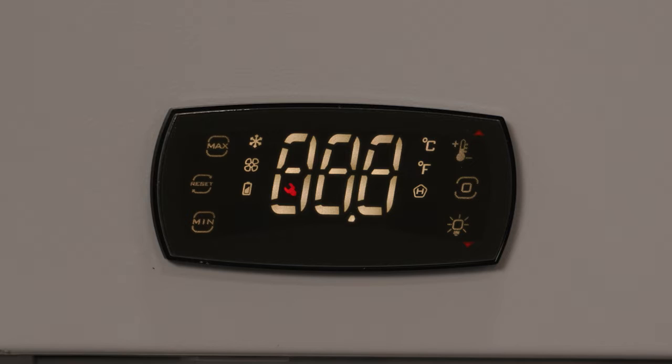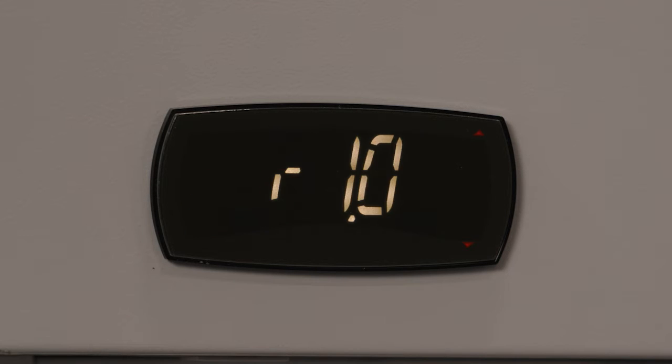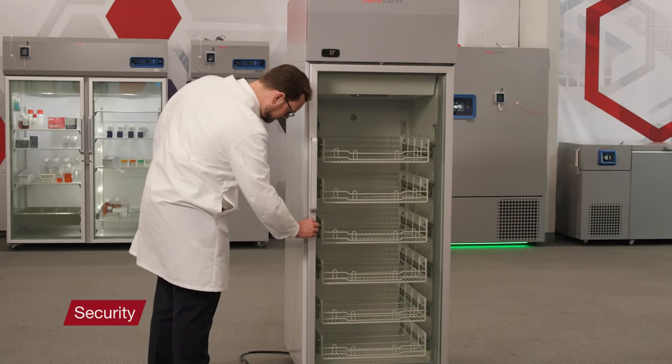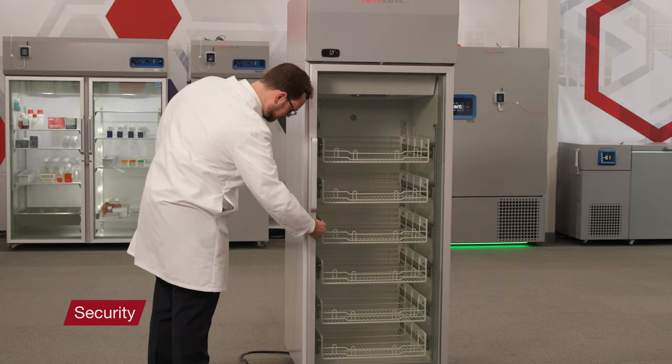When powered, the user interface will briefly show the firmware version and the standard display. Temperature alarms will engage when the unit is powered on. If you are using a remote alarm, connect it now. To lock the refrigerator, use the silver colored key.